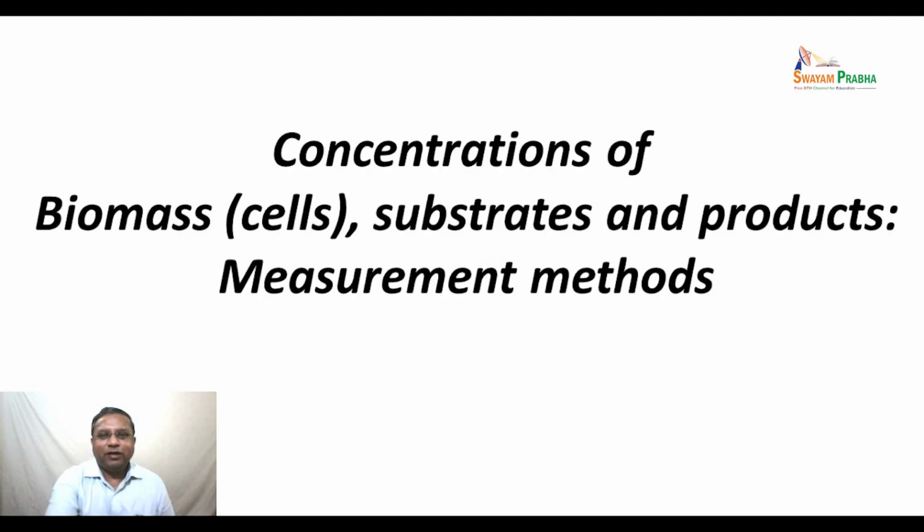The last aspect that we are going to see in this lecture is the concentrations of biomass or cells, substrates and products, the measurement methods.